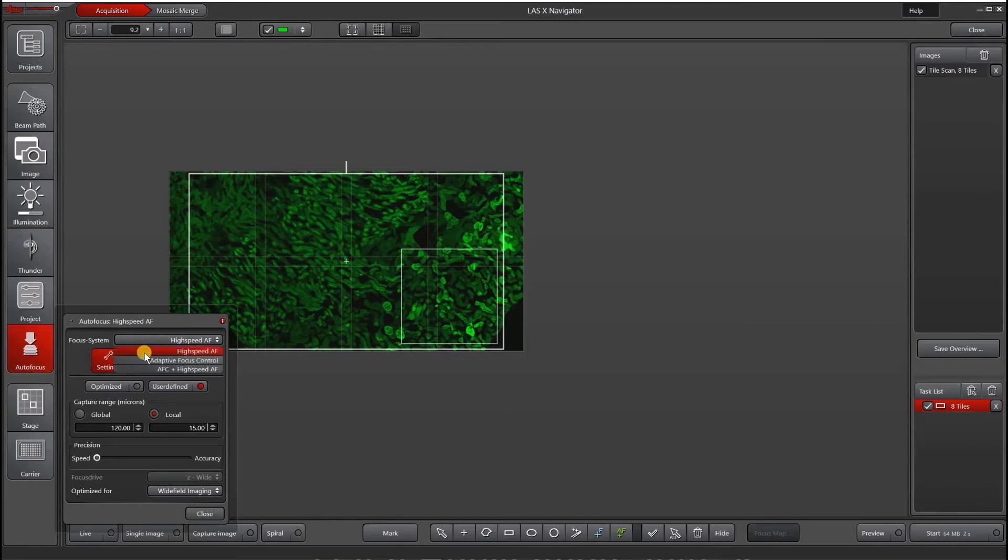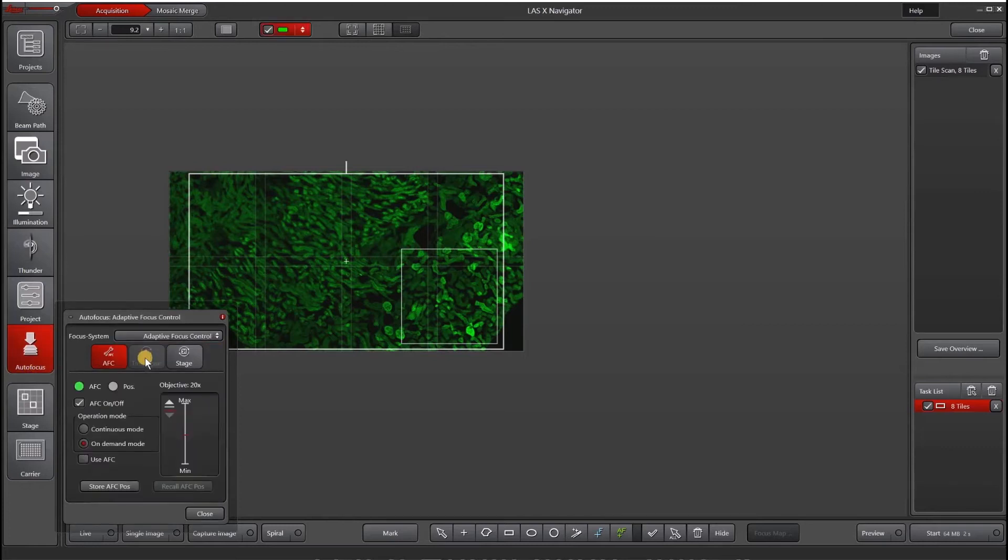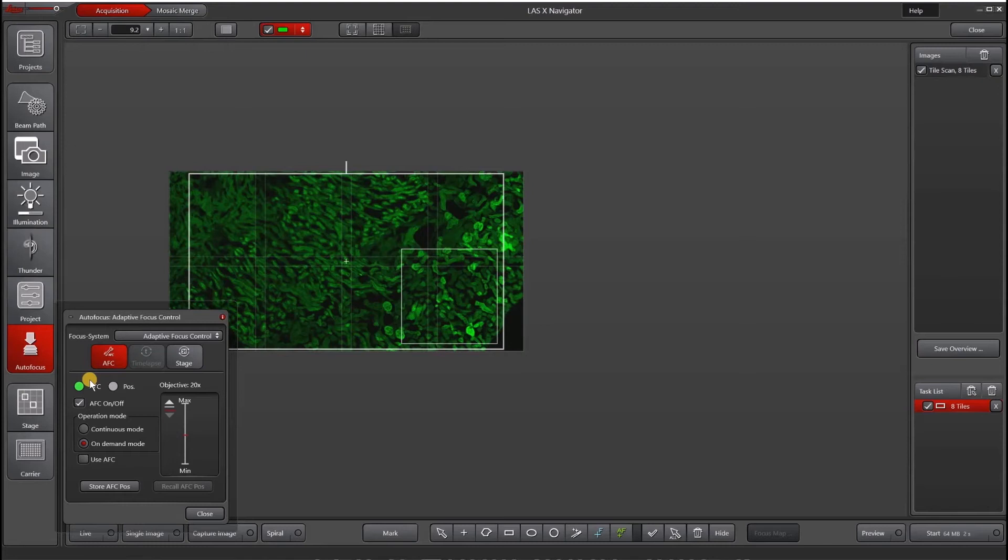Under the focus system, I will choose adaptive focus control. You'll see a green light here when we're using AFC compatible objectives, when AFC is inside the range and the device is active. You can also turn the AFC on and off in this window.